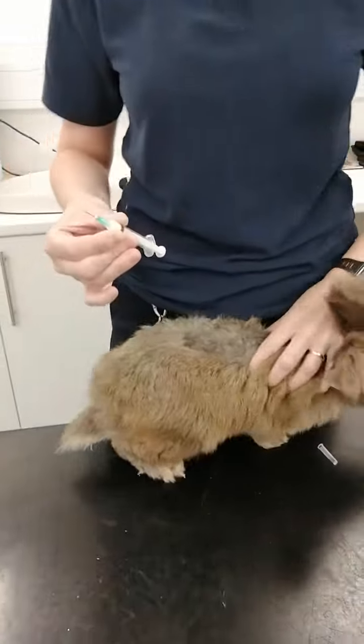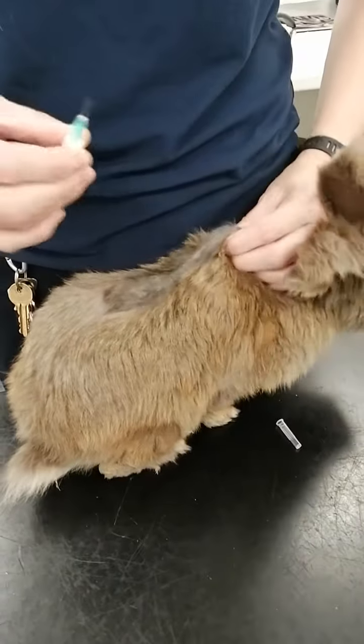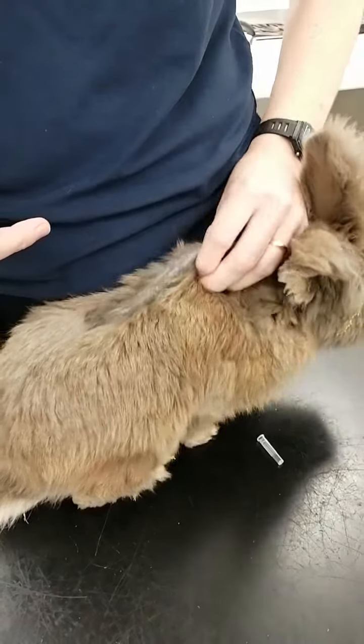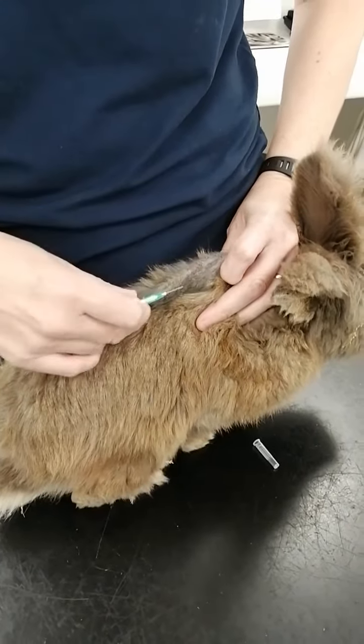We're then going to tense the skin up so that we make a triangle at the base in which to inject. Cookie's got a bit of a skin condition which makes it a little bit easier to see what we're doing. So we take a big handful of skin and, as you can see, that just tenses it up at the bottom.